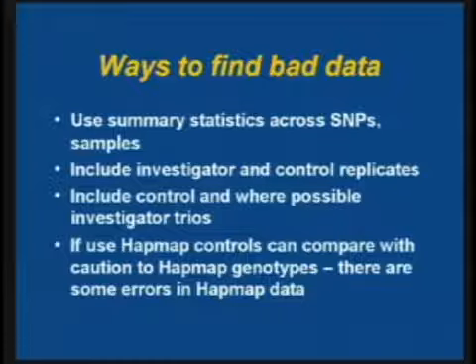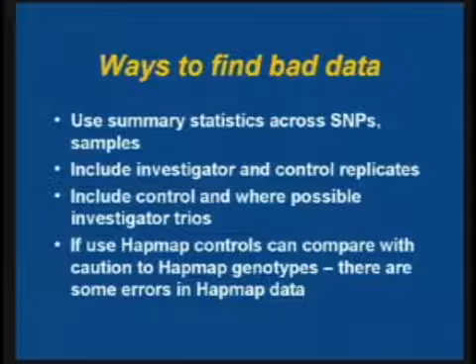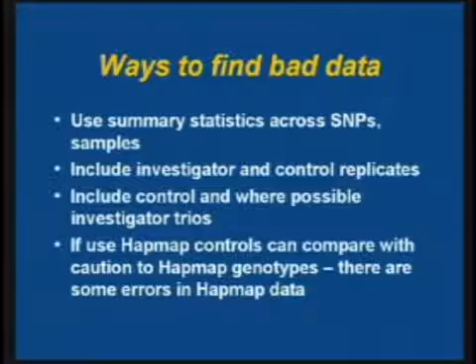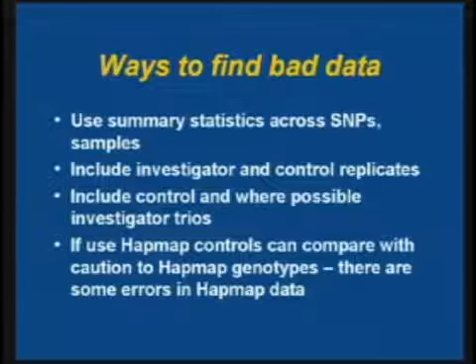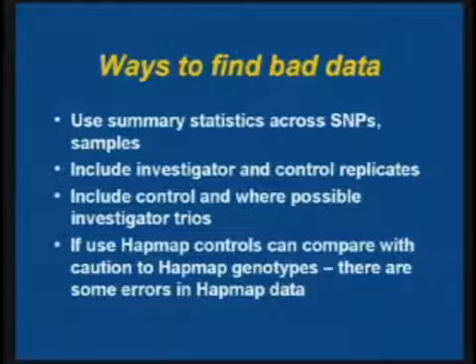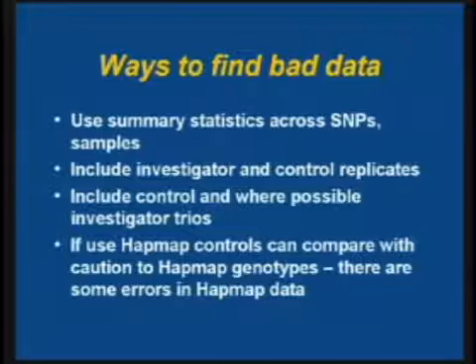So how do you find the bad data? You use summary statistics across SNPs and across samples. You include investigator and control replicates in your samples to be genotyped, even though you have to pay for them. You include control and, where possible, investigator trios — even if you're sending cases and controls, if you have any relatives, you may want to include parent-child pairs or trios to look at inheritance. You can use HapMap controls and compare the genotypes to the HapMap data, but be cautious because there is error in HapMap and some differences are just caused by that error or platform differences.